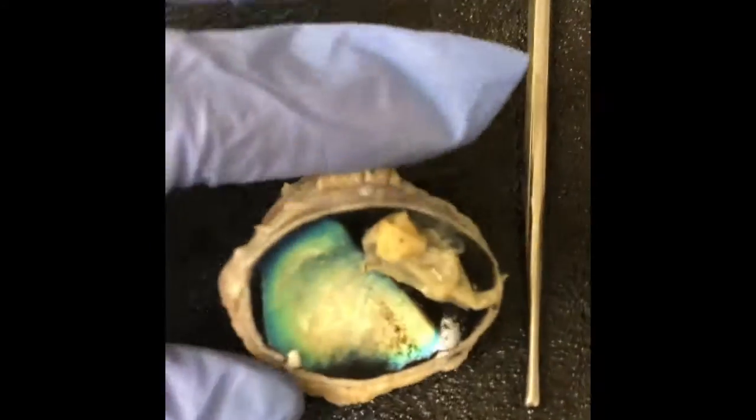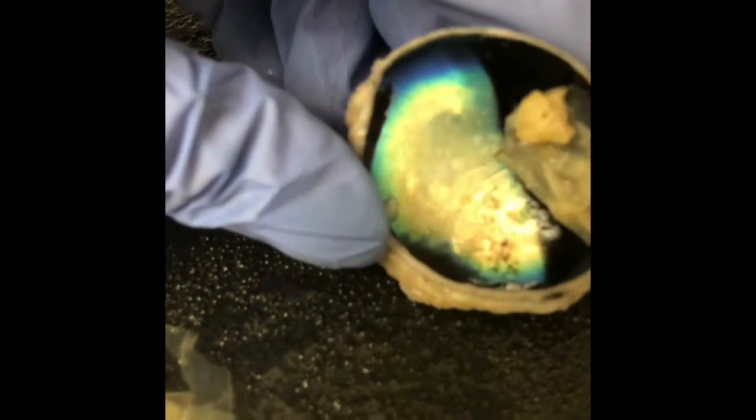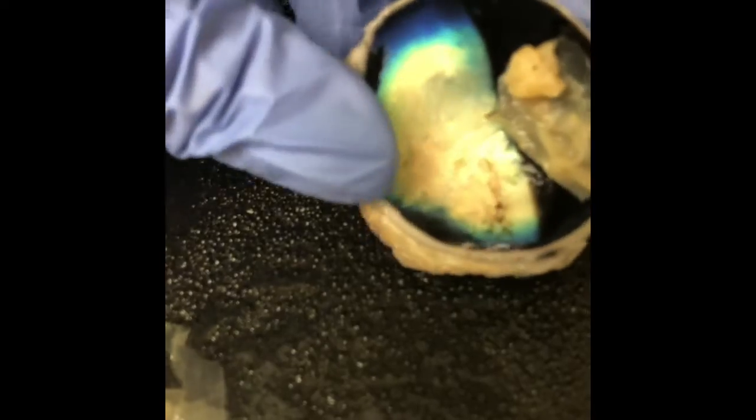The most interesting thing that I found about the cow's eyeball while dissecting it was this part right here. So this is called the tapetum lucidum. It's very shiny and like a few different colors. You can see a little yellow, green, and blue in that.